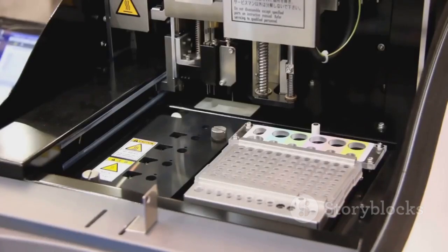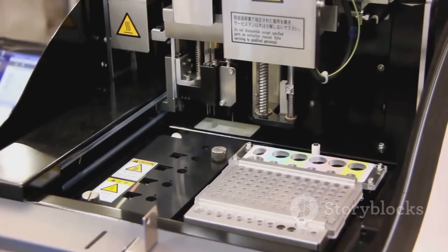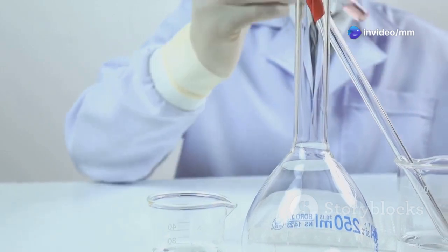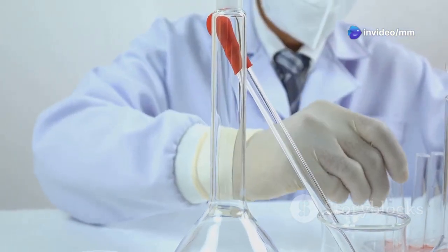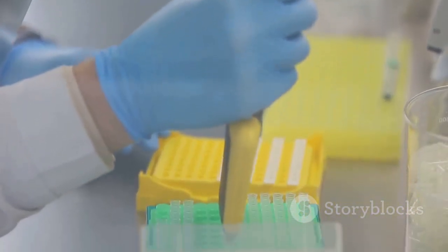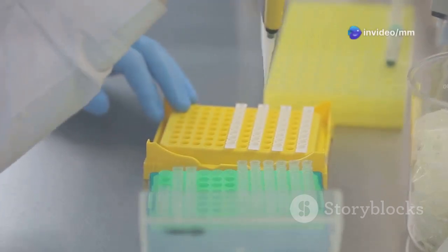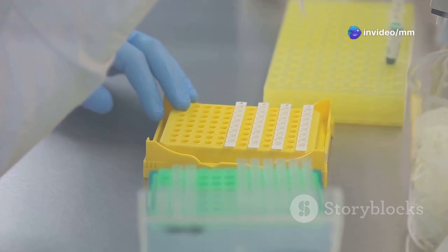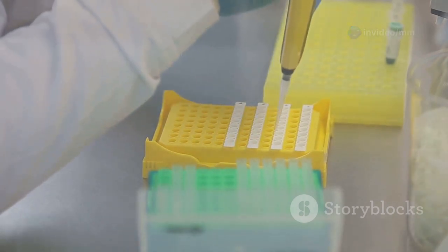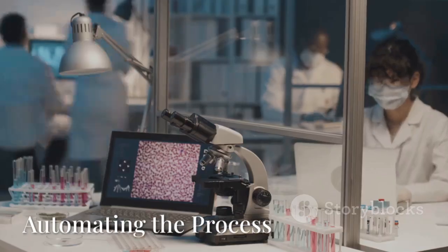Next, these fragments are separated based on their size, using a technique called gel electrophoresis. It's like a race where the DNA fragments run through a gel, with the smaller fragments moving faster and further than the larger ones. Finally, the gel is read, revealing the order of the DNA bases. Each chain terminator is labeled with a different fluorescent dye, allowing us to identify the final base of each fragment. By reading the labels from the smallest to the largest fragment, we can deduce the original DNA sequence.